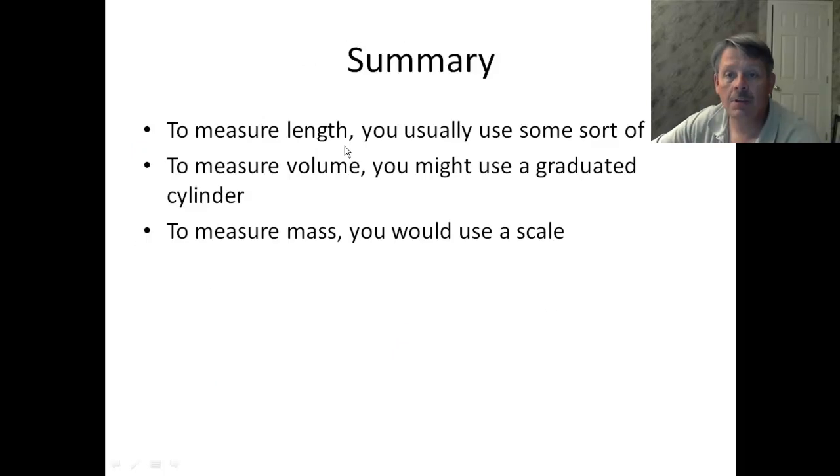All right, so to measure length, we're going to use some sort of ruler, typically a meter stick. To measure volume, you probably are going to use a graduated cylinder in class. And to measure mass, you would use an electronic balance scale. That's what you need to know.